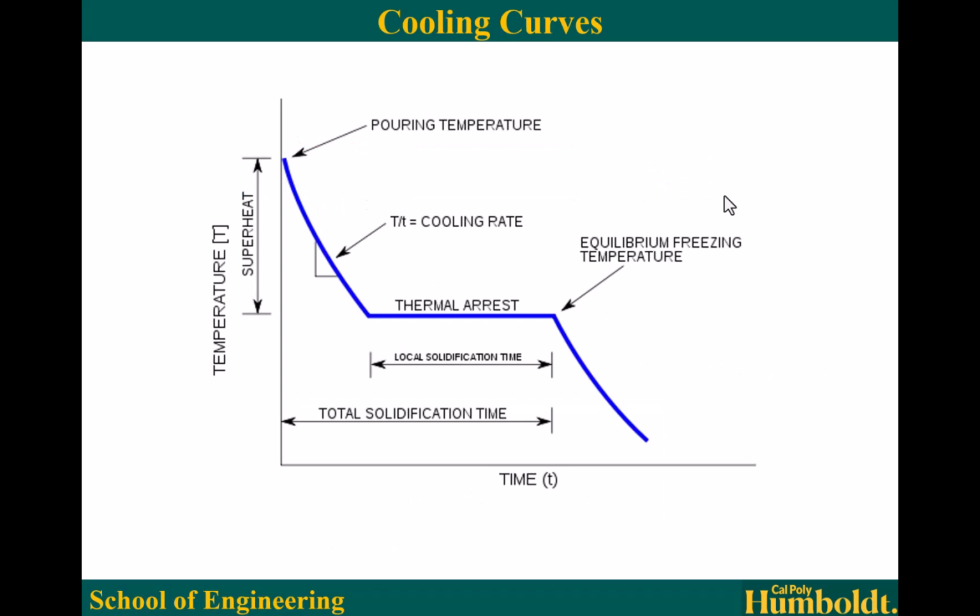Now, we're going to be melting these materials. We're going to melt the polymers. We are going to measure the temperature with a thermocouple. And you see we're going to find essentially a heating and cooling rate. And then you'll see a region where there's a change in slope. Now, this thermal arrest is very exaggerated, except for pure materials. So you'll see this change in slope, and then this is where we start solidification, and then you can see where it ends as well. So that's the concept that we are working with here.